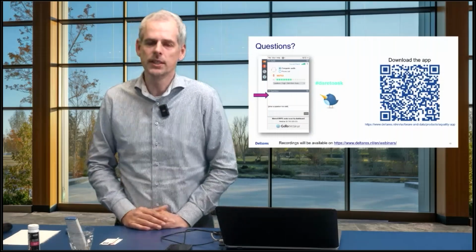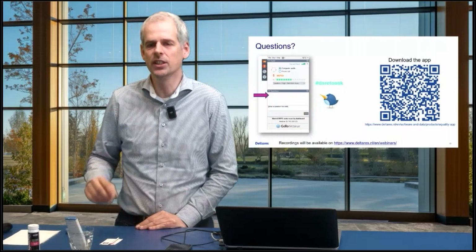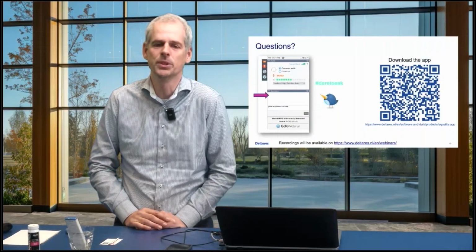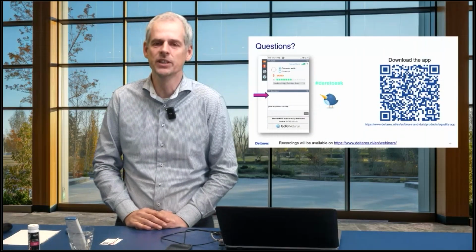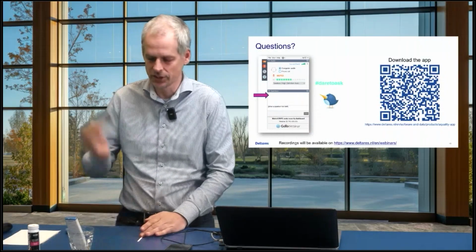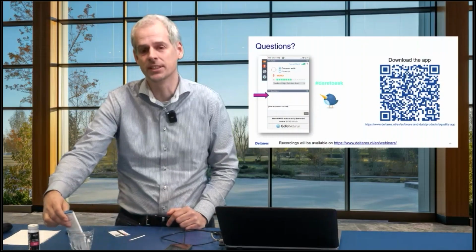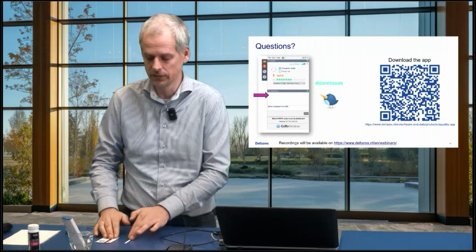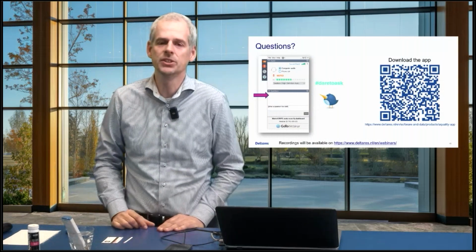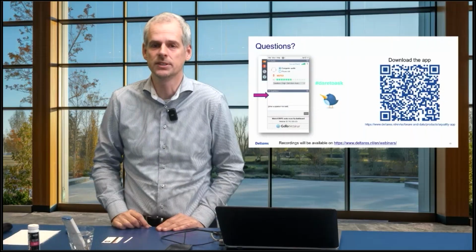Yeah, within the app, as I just showed, in the settings, at the lower end, there's a sort of in-app web shop. So there's information where you can order the test strips, the reference cards, the stickers for the EC meters, and also the EC meter itself. Otherwise, go to our website. There's also an instructions document, user instructions.